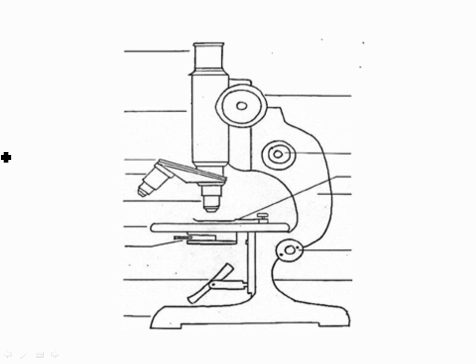Ocular lens, awesome. Ocular lens, excellent. Ocular simply means pertaining to the eye, and that's where you look into. The ocular lens typically has a magnification of ×10. Most ocular lenses will magnify something by 10 times, and ours definitely does that.